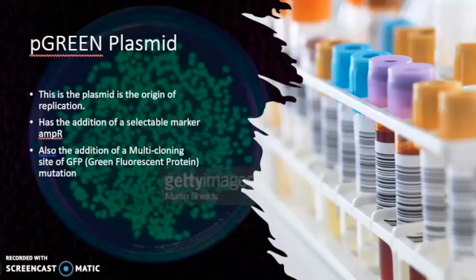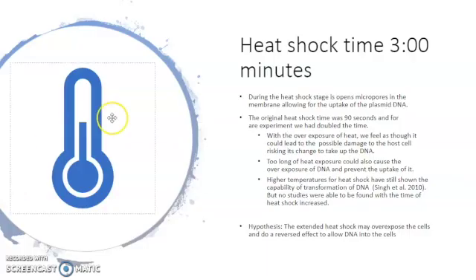And the GFP mutation, which is derived from a bioluminescent jellyfish, Aequorea victoria, allows the bacteria to glow a greenish yellow under UV. And in the picture behind, you can see an example of this GFP mutation and the glowing color it represents and gives off.